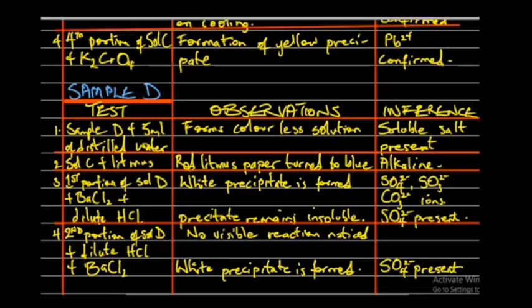So we continued our check. We had to do a confirmatory test now, since we had seen SO4 showing up in two or three places.